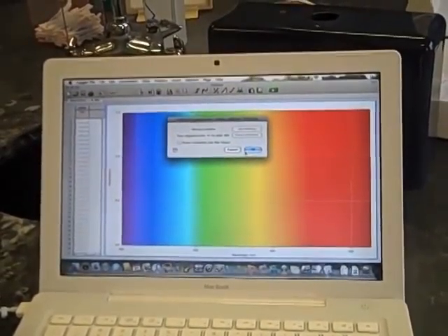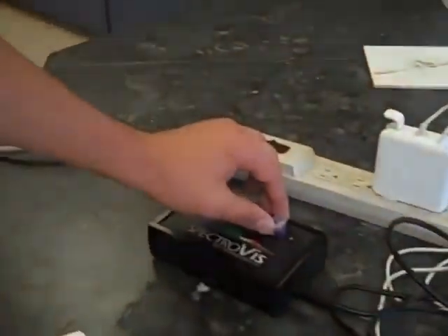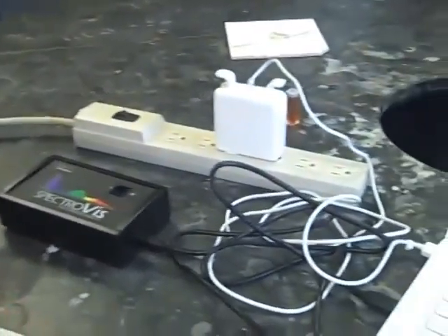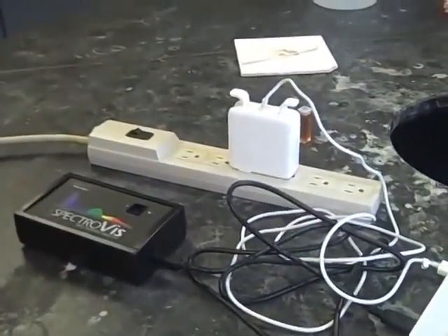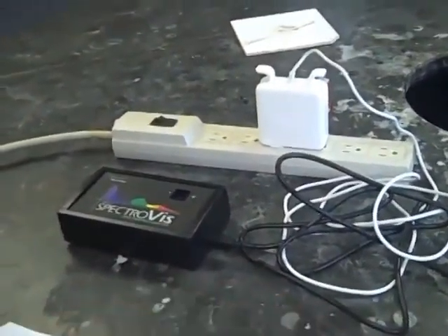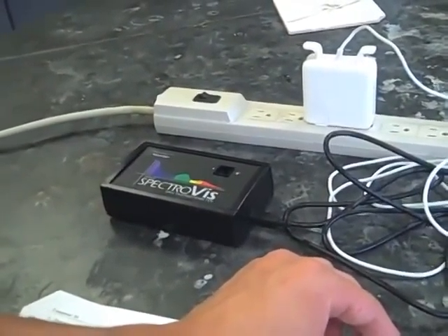Okay. Now we are going to remove number 5. And we are going to put in number 1, and this isn't the beginning of the actual experiment, but it's kind of the precursor. Step 6? Yes, step 6. Okay, good to know. This is step B of 6.